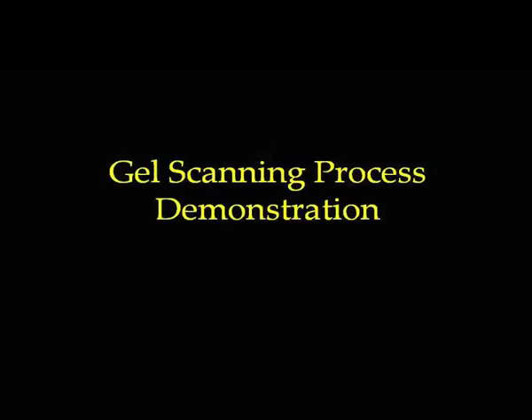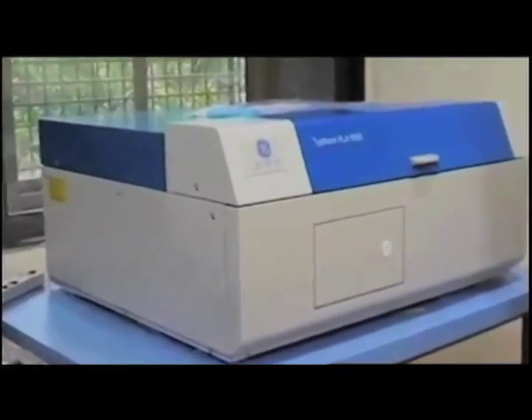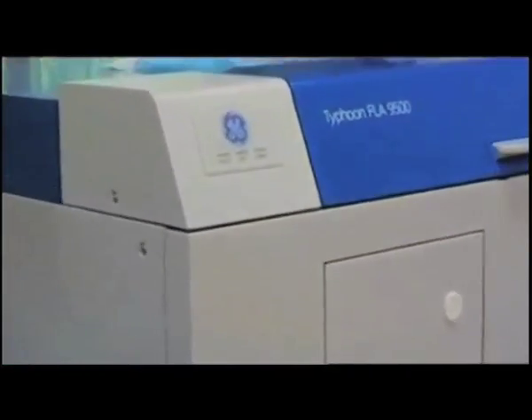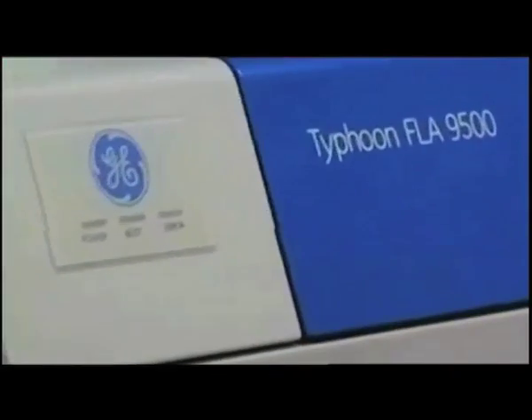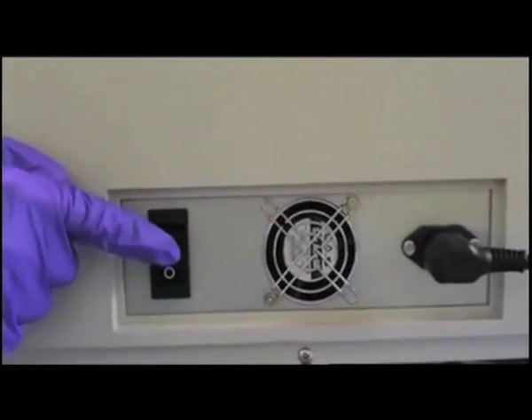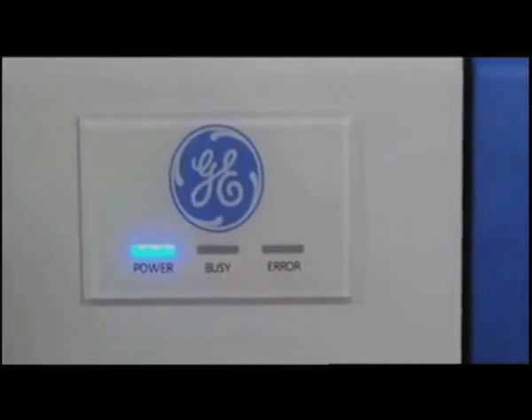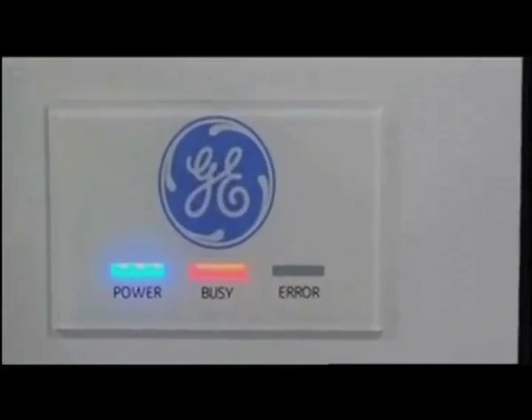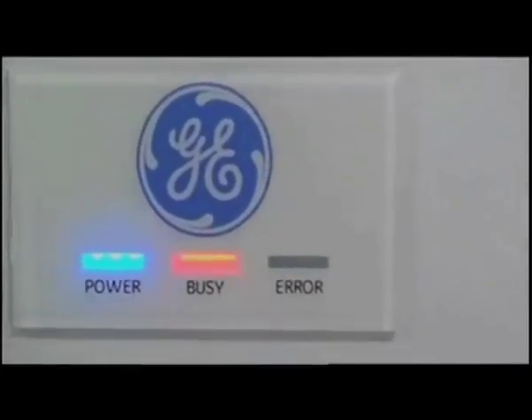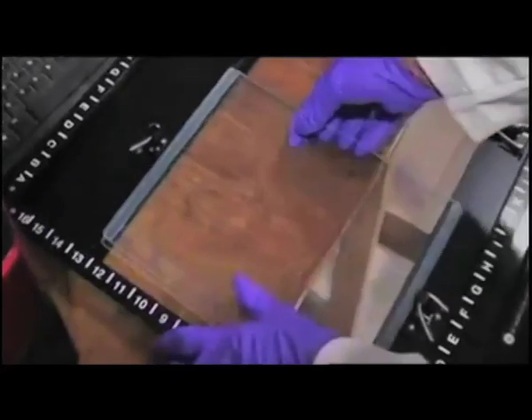Dye gel scanning. 2D dyed gels will be scanned using a Typhoon variable mode imager at a 100 micrometer resolution, employing suitable excitation emission wavelengths. Switch on the Typhoon scanner. Place the gel plates on the tray provided as shown and insert it in the Typhoon scanner.